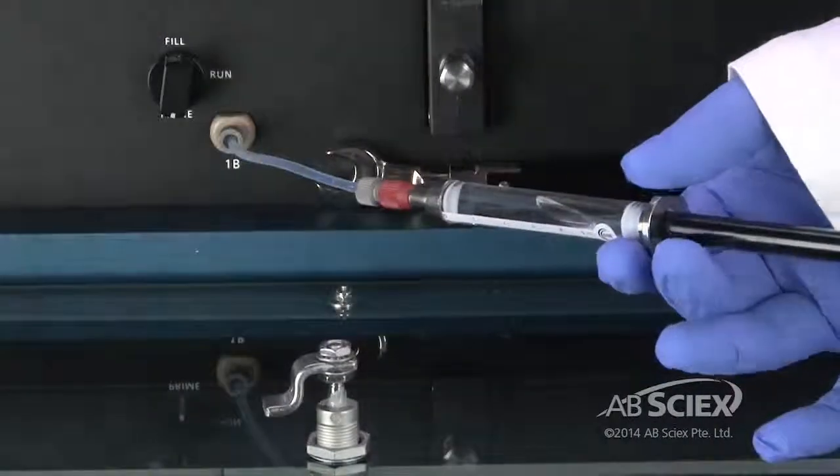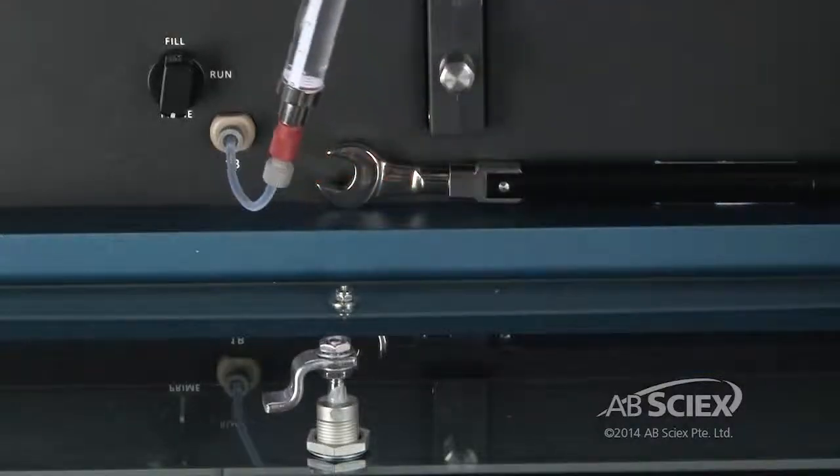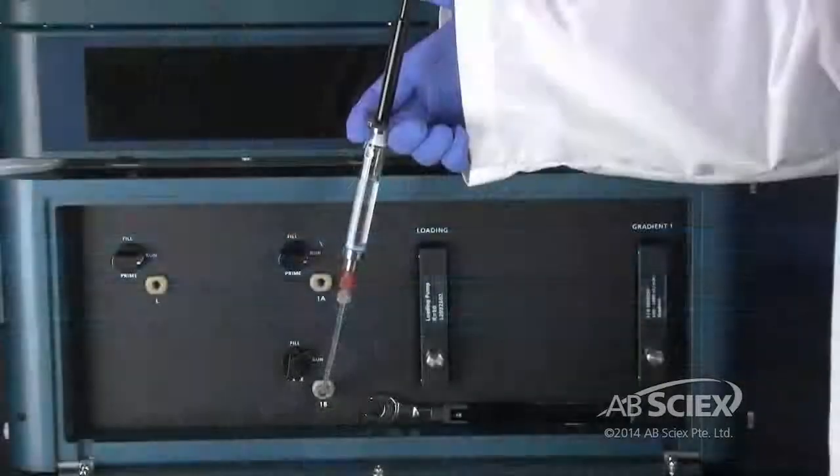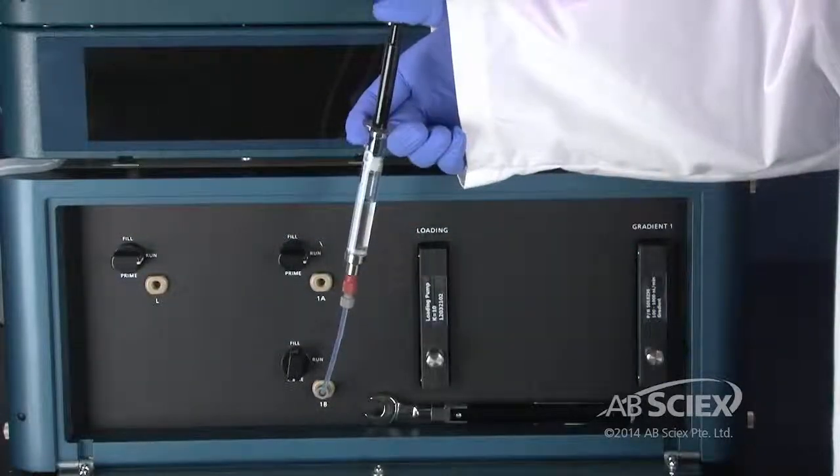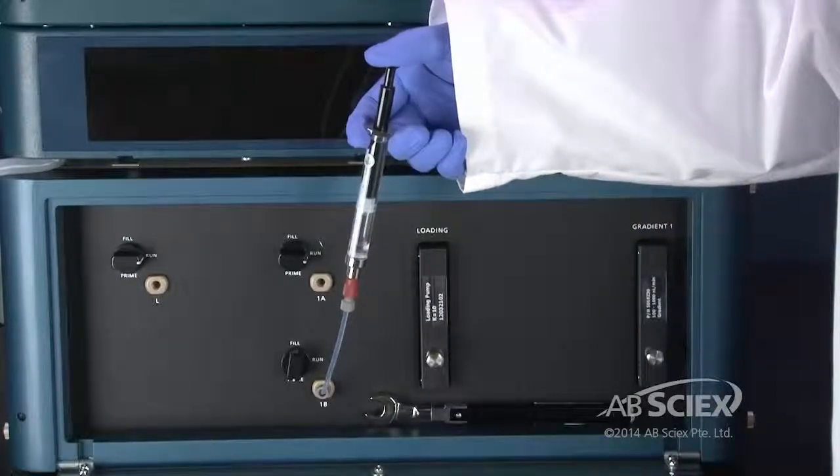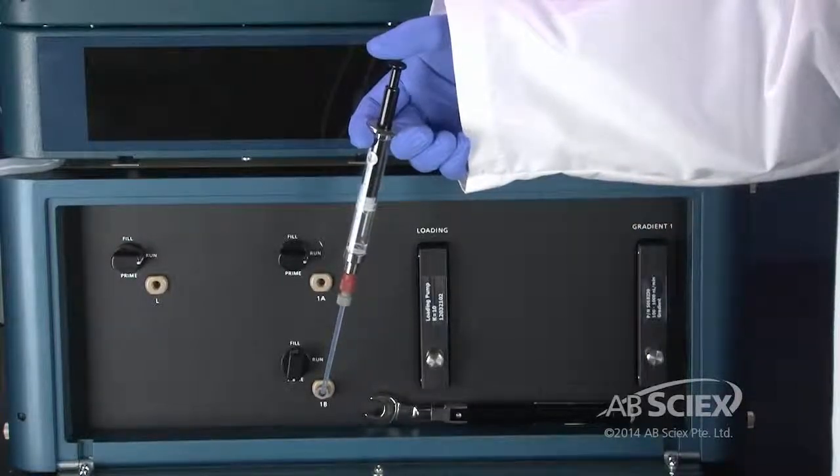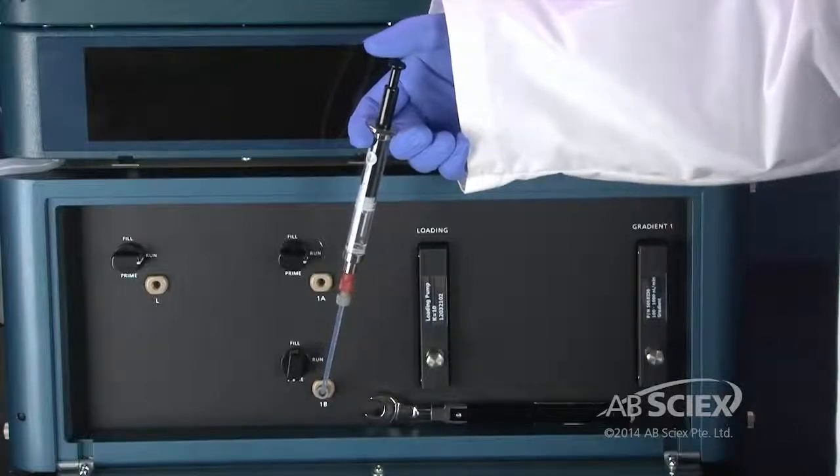The prime position connects the syringe to the pump. Position the syringe vertically to allow any bubbles to float to the top of the syringe. Then depress the plunger to push mobile phase from the syringe to the pump.